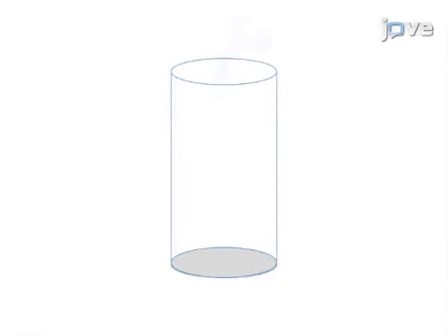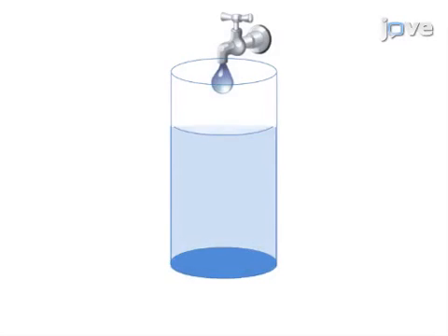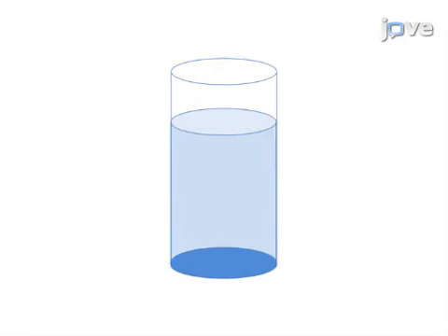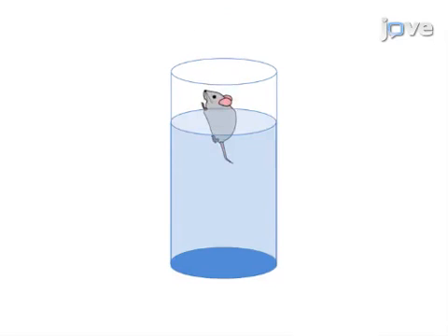This is accomplished by first preparing transparent cylindrical glass containers filled with water to a depth in which the mouse cannot touch the bottom with its hind legs. The second step is to place each animal in a water-filled cylindrical container and film the behavior of the mice for a total of six minutes.